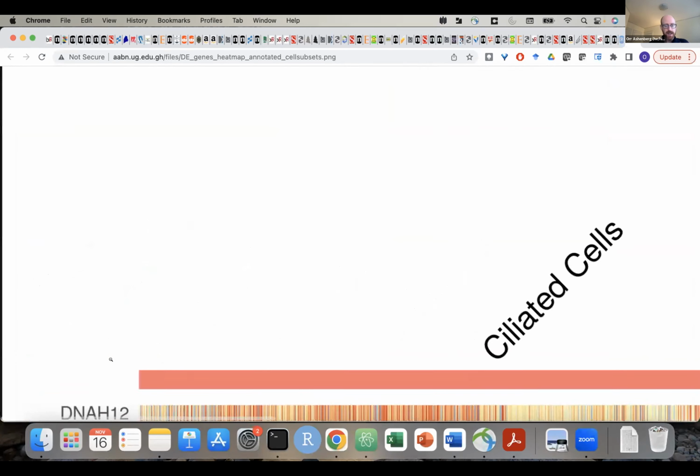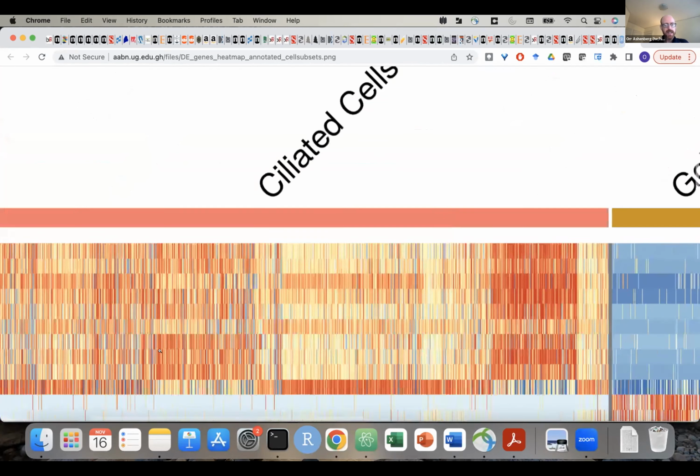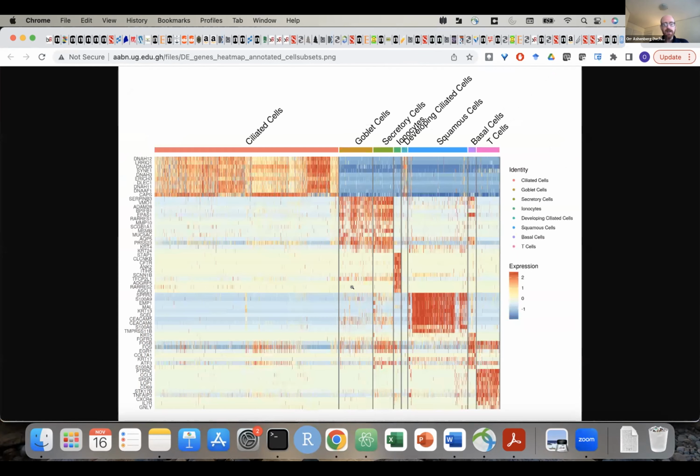Okay, but yeah, you can kind of see, depending on how you subset the data, you'll be studying different differentially expressed genes. And so often what we do is an iteration between clustering, where we might cluster in different ways and get different cluster assignments, and then look at the differentially expressed genes. And we might say, aha, these are T cells, but these genes here make no sense to me.